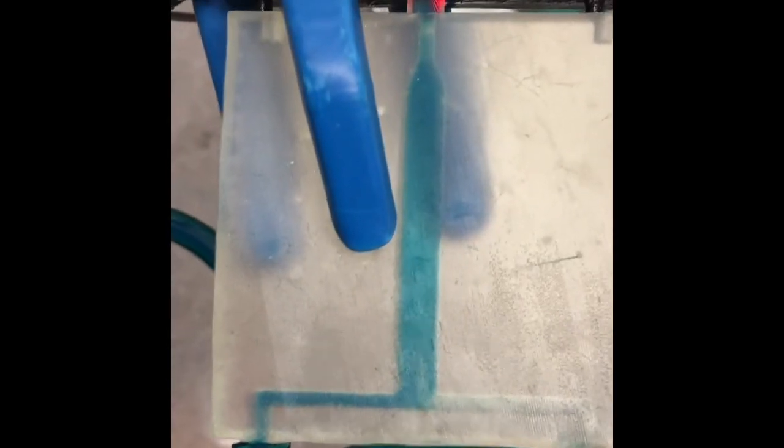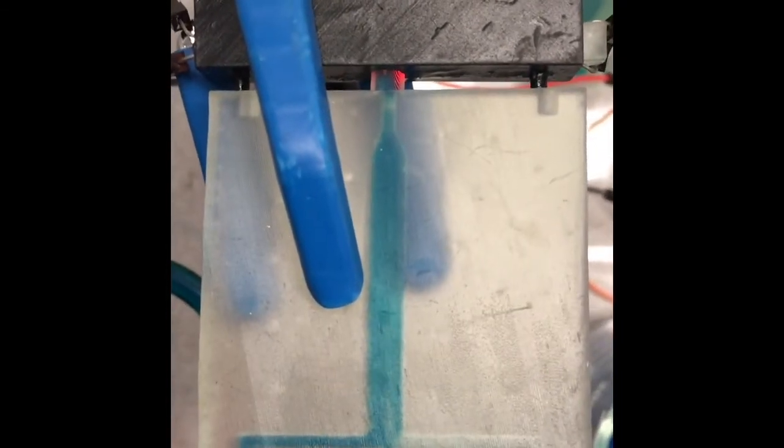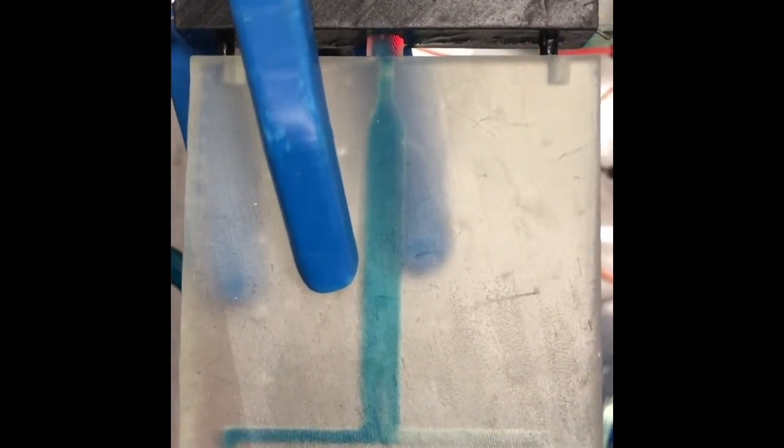Now we'll take a look at 3 reactors flowing at 15 milliliters per minute. Here we see the T reactor, which produced the lowest conversion of malachite green. The 2 reactants interact and begin to flow downward, but very minimal mixing occurs. In fact, almost all the mixing that is seen is due to the high flow rate.